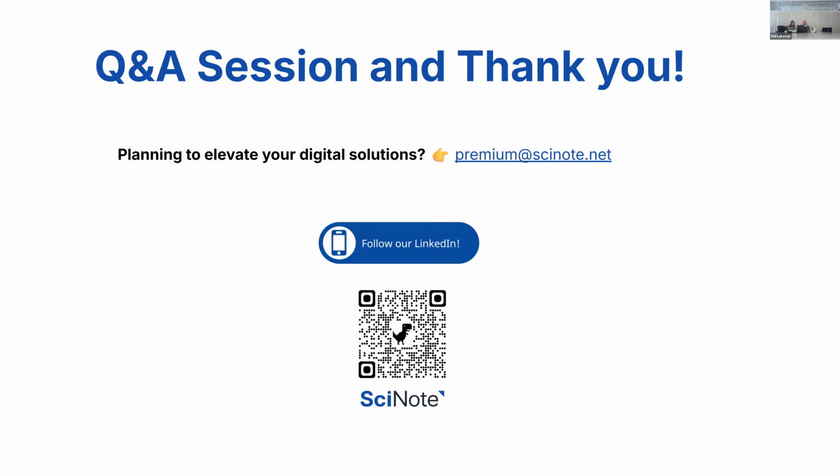Maddie came back with, we like the bulk repeated parent. Yes. So the stock would include, okay, we created 20 aliquots, and when you would be using those up, the unit would be aliquot, and you would be deducting the aliquots. And again, you would be able to set up a threshold when somebody would get notified, hey, we need to make the aliquots again.